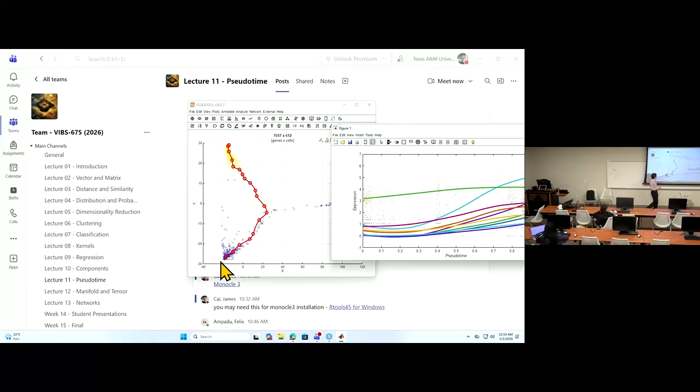You believe the cell trajectories go that direction, and after you create this trajectory yourself, you can see, okay, this is time 0, this time 1, time 2, and it gives me some genes which follow the trajectory. I can have some picture like that. And this curve will be saved in temporary files. If you want to reload them back, you can. Okay, so that's the way we do things.